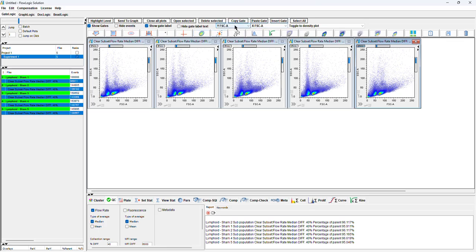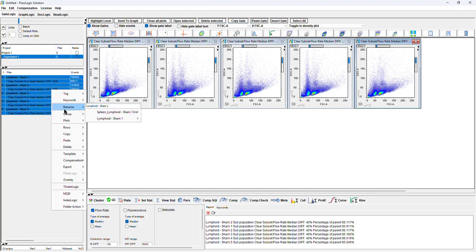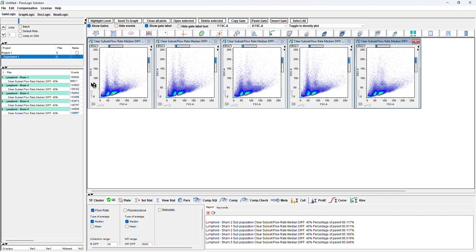This is selecting. Now, if you are in a group, you don't need to use any of these, and everything gets transferred. But if you are out of the group, we take things out of the group. When we change something, it will be changed just here. So, for example, if we change our x-axis, the rest is not changed.